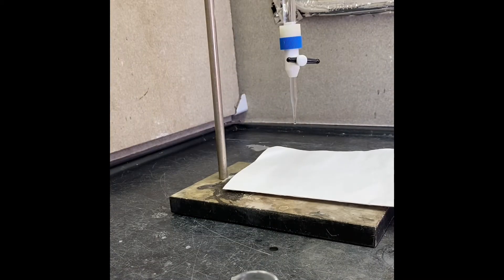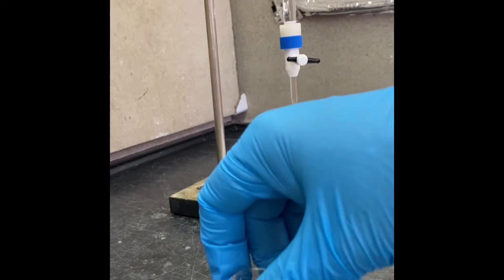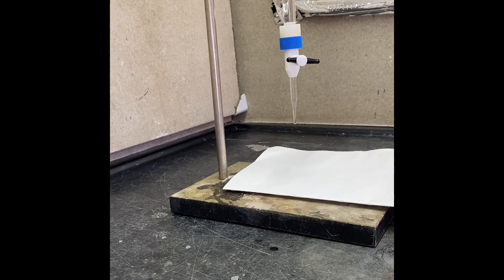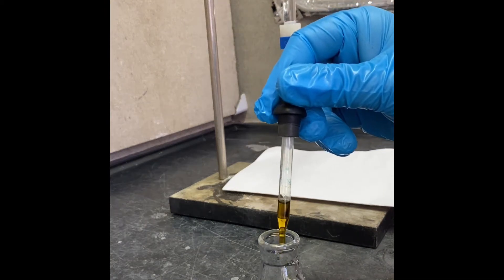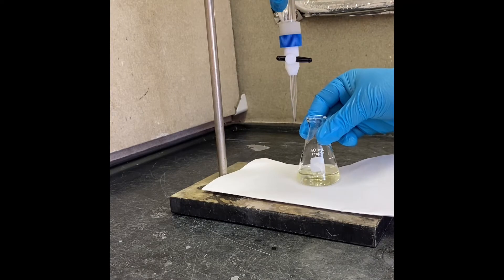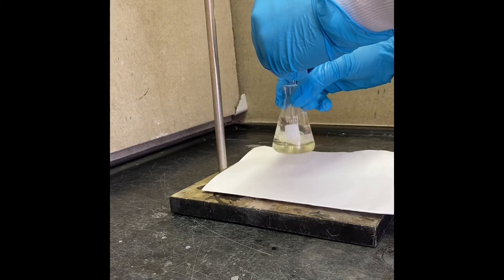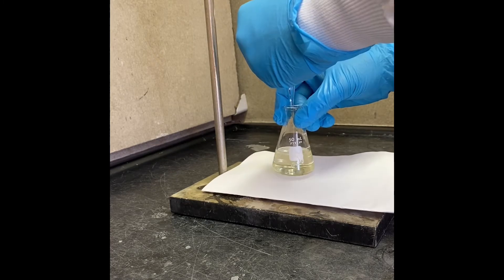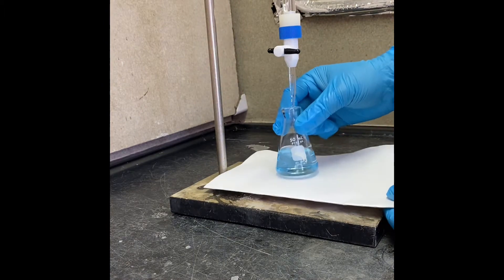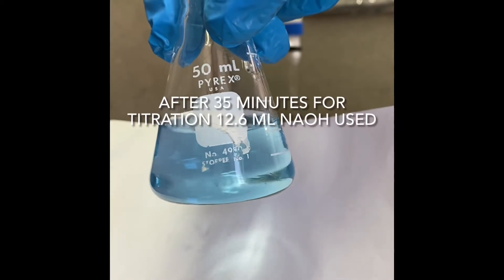Now we're ready for the third solution measurement, which is after 35 minutes. I have 10 ml of acetone in my flask and I'm going to add 10 ml of the reaction mixture, with three drops of indicator. Again initial color is yellow. Let's start adding sodium hydroxide. The color is now constant and not disappearing, so this is our third titration.